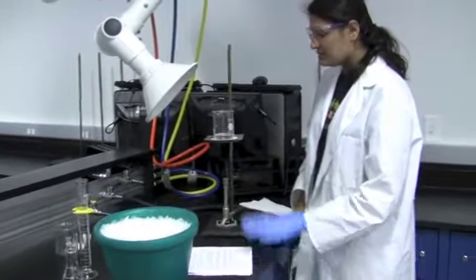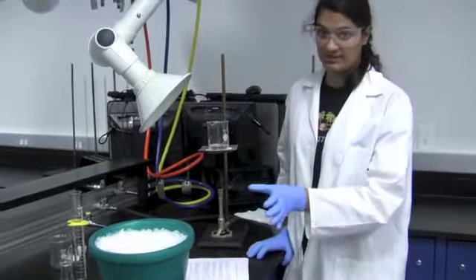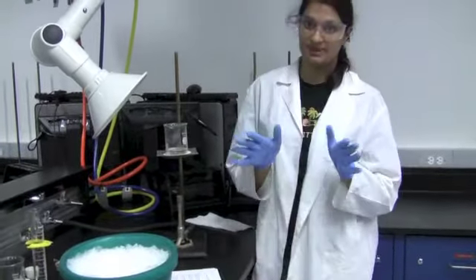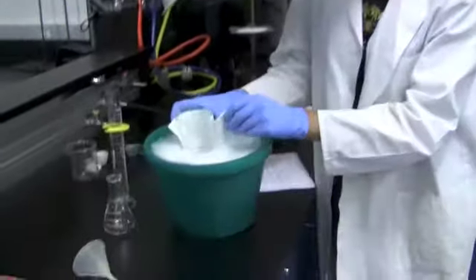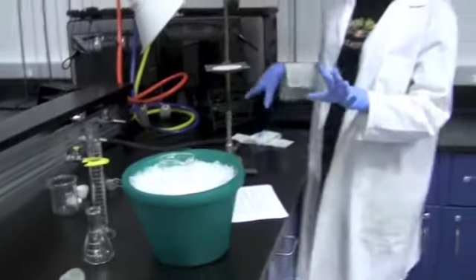And now you're going to want to take the clear solution, turn off your Bunsen burner, and add it to an ice bath. However, you never want to directly take your beaker from the Bunsen burner to the ice bath. You want to wait about a minute for it to cool. Once it's cool, you're going to take it, place it inside the ice bath, and make sure that you keep it as motionless as possible.